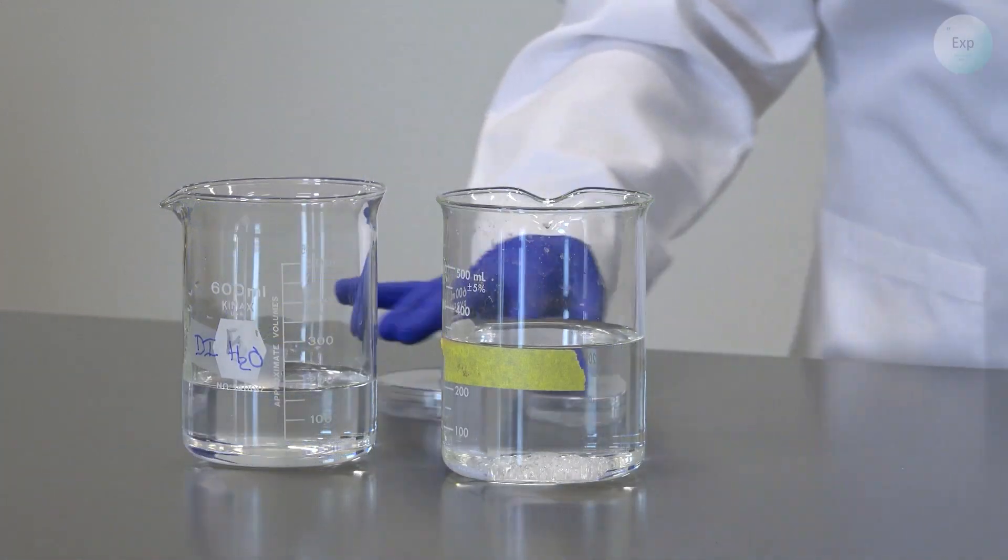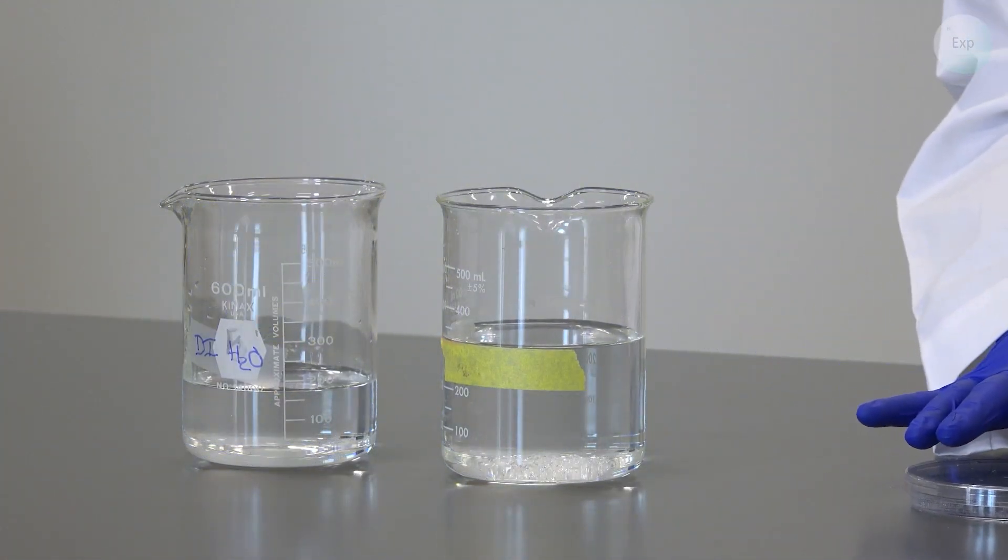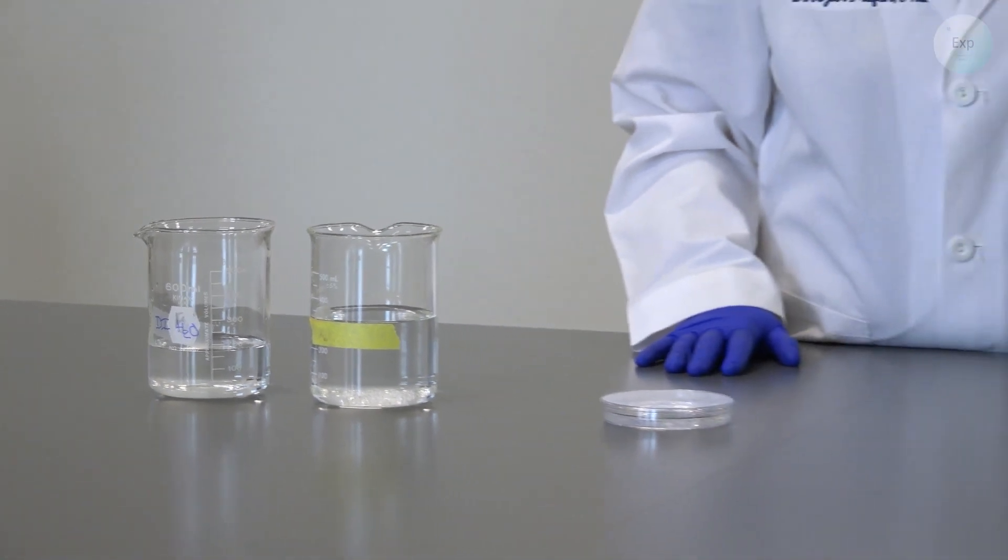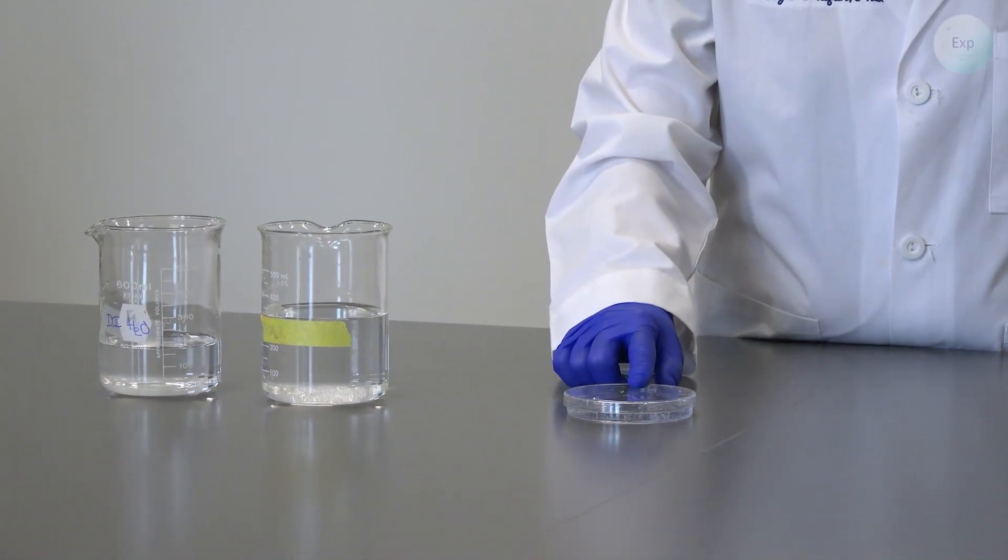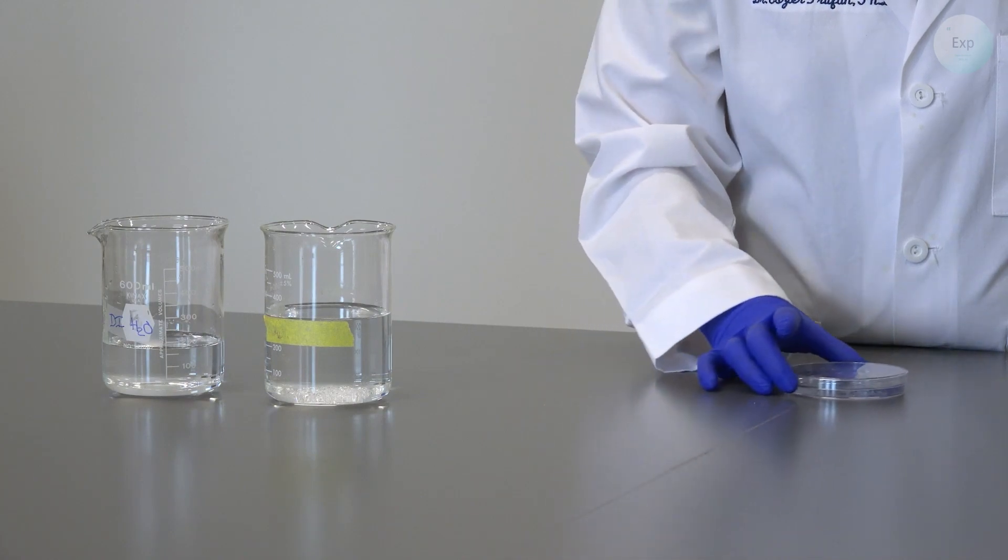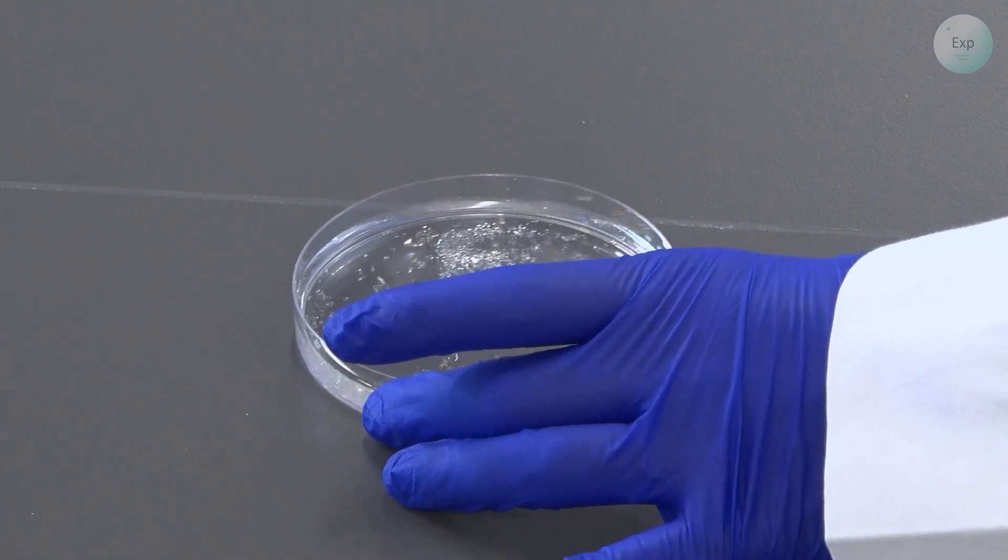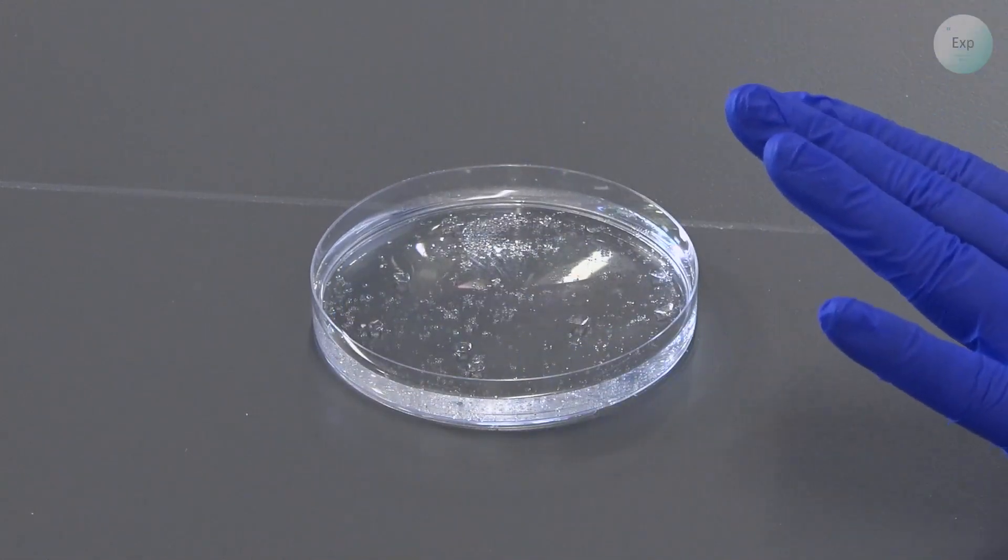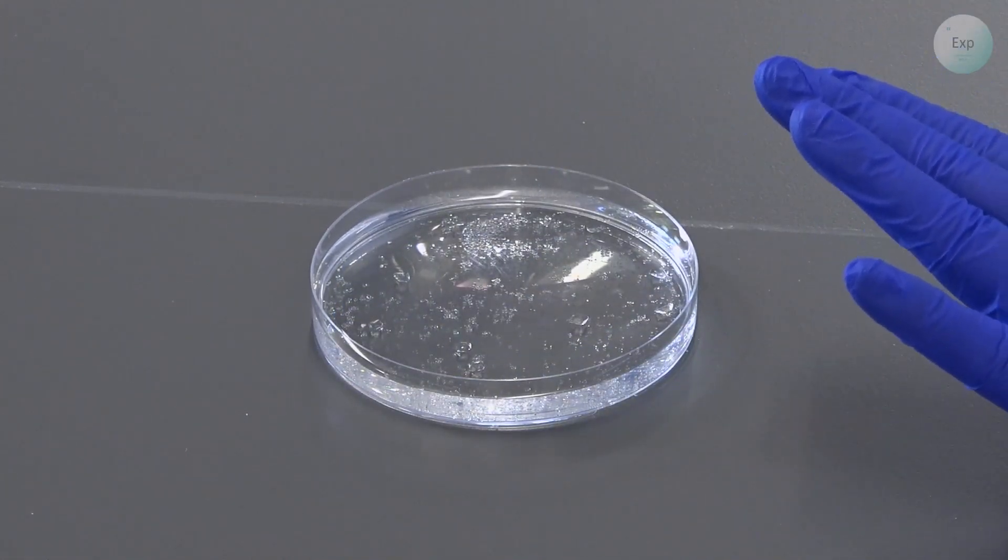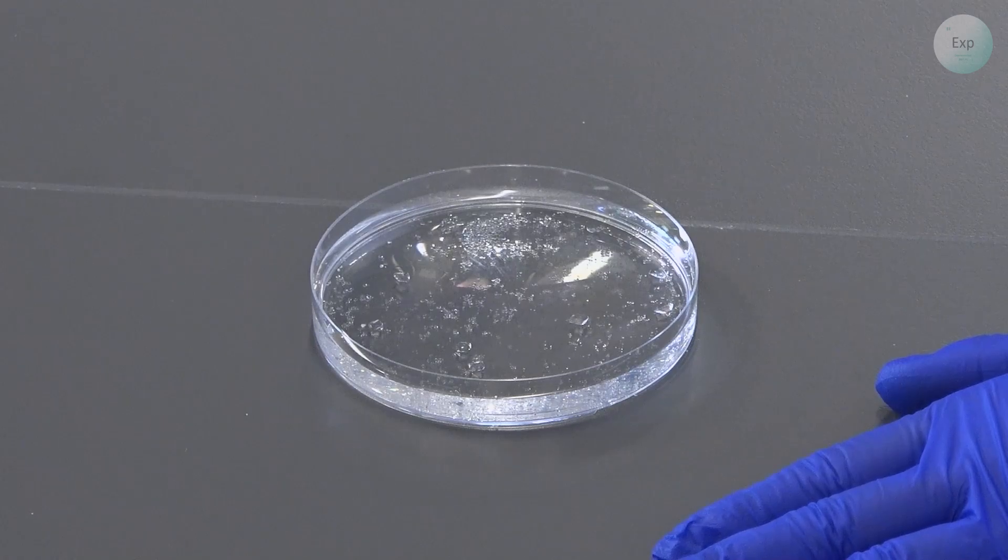Then, that petri dish that contains my original grow solution is now in a far more advanced stage of crystal growth. In this one, I can see that there are small crystals and large crystals forming. I want to carefully select the large crystals so that they may grow even larger in the coming days.